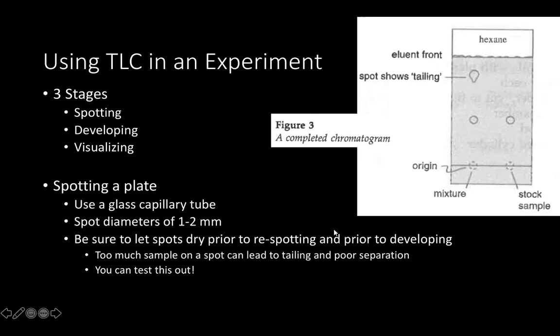So in your lab this week, they actually have you testing 1 time application versus 2 time application, and you can try out even 3 times applications if you want, to see if you can see that tailing, to kind of catch an eye for this for labs when we'll use TLC in the second semester.